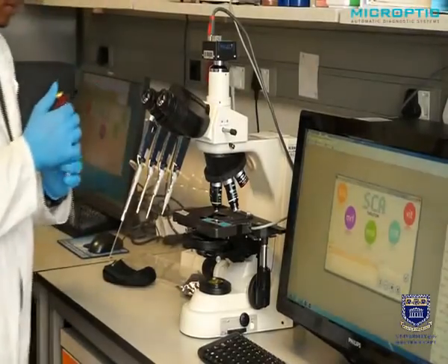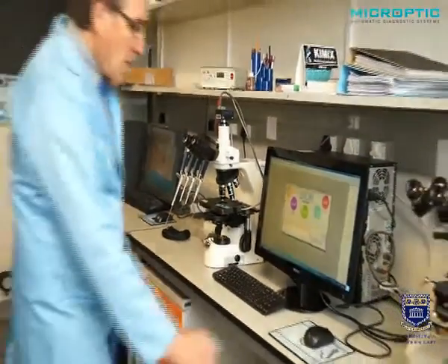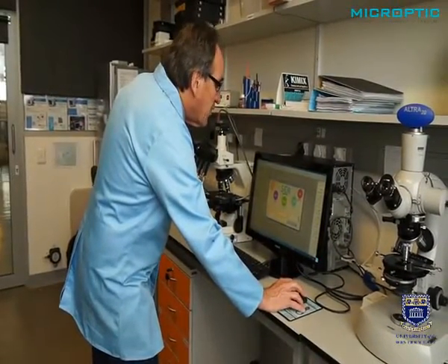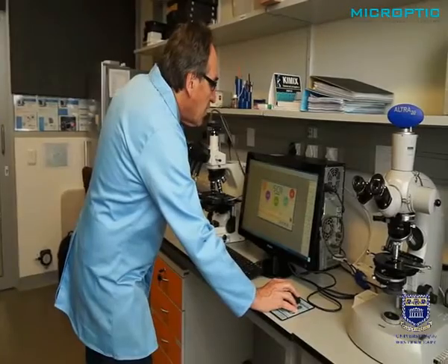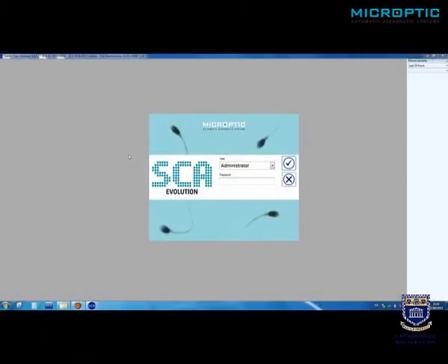We leave it there for approximately 30 seconds. In this time, I have already selected the configuration that I require, in this instance human sperm. We're just going to do a short demonstration of how the motility component works.